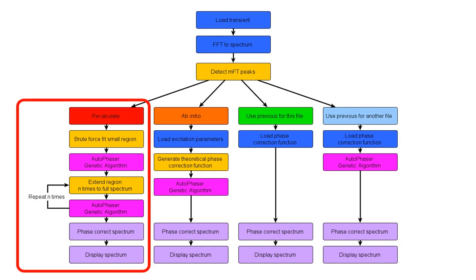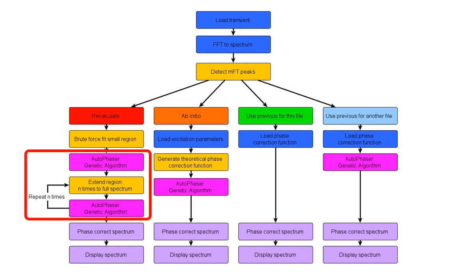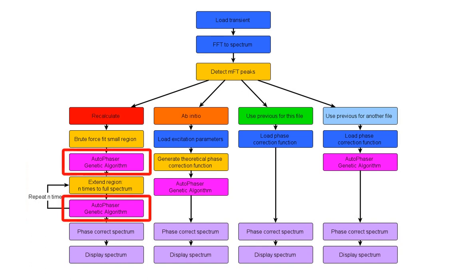The first of these routes is known as Recalculate. If you process your spectrum by this route, Autovectus will attempt to generate the phase correction function based only on the data in the spectrum itself. It does this by brute force fitting a phase correction function over a small region in the spectrum and then extending this out several times to cover the whole spectrum, using a machine learning method to optimize the phase correction function at each stage.